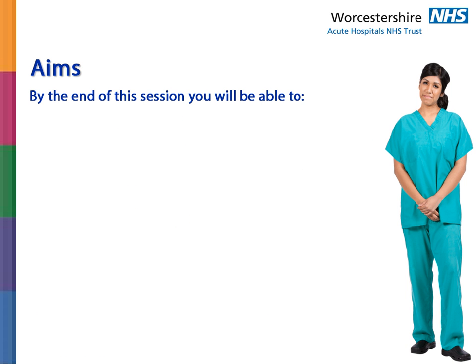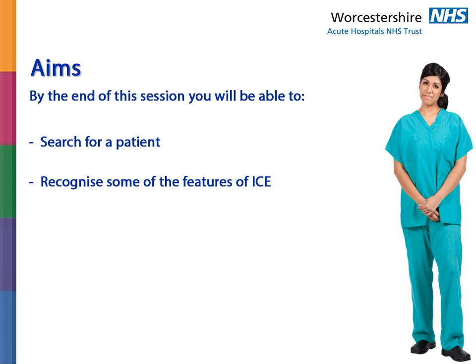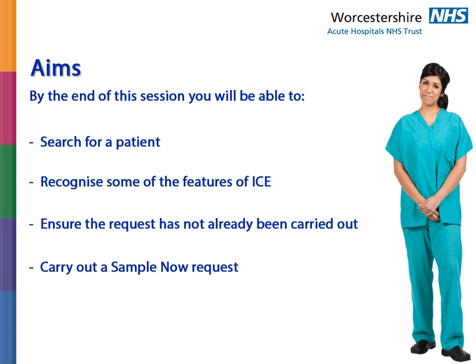systems. By the end of this session you will be able to search for a patient, recognize some of the features of ICE, ensure the request has not already been carried out, carry out a Sample Now request, and print off the forms.